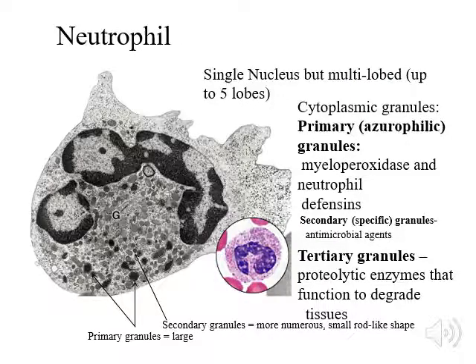An electron microscopic view of the neutrophil demonstrates very nicely the multi-lobed architecture of the single nucleus. And you can see all of the cytoplasmic granules that contain various enzymes slated for antimicrobial activity. The one thing to appreciate in this picture is that neutrophils really lack a lot of cytoplasmic organelles, so they're not able to produce new proteins, with very limited protein production. Thus, neutrophils are incapable of continued function. When one neutrophil is carrying out a burst of activity, that is the end of its life.